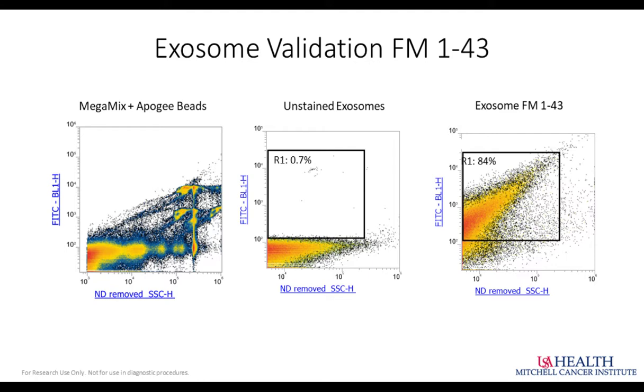We do see some variability, so you could go anywhere from 50% on the low end up to maybe 90% on the high end of purity using differential centrifugation, and that's why we do all of these QC steps for every single preparation we make. Differences in what the sample starts from, be it culture supernatant versus a body fluid, but even what you would consider fairly uniform culture supernatants can provide different purities in preparation. So it's really important to do all of these upfront QCs on every single preparation.